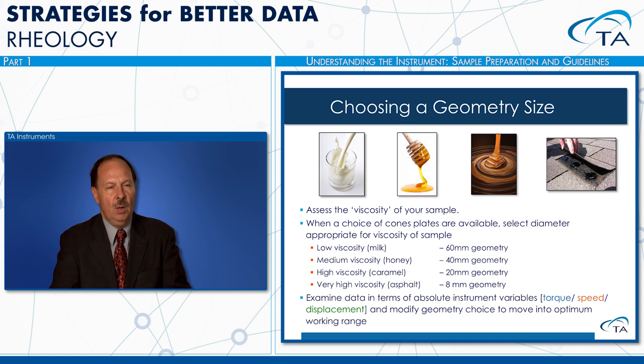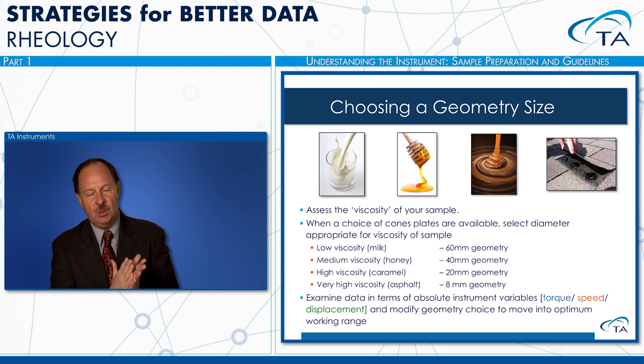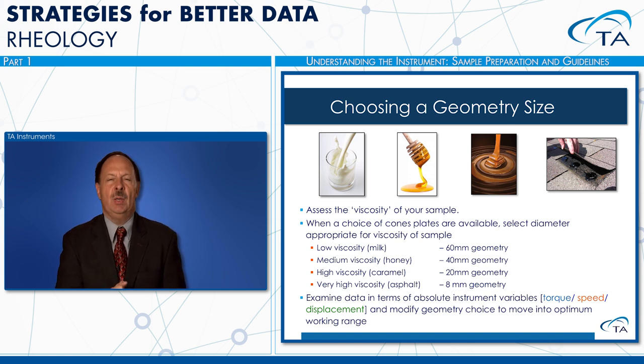So when you look at your data, most of the time what people are looking for is, give me a geometry and give me the test conditions that will give me good data. Most of the time, people aren't that picky that they say, I really have to know this right on the edge of the instrument sensitivity. Most of the time, people just say, I want to get a good, reliable, and reproducible measurement of the rheological properties of our material. With the geometries that we have available and doing the right test type, you should definitely be able to get a good rheological characterization of just about any material that you could be working with.